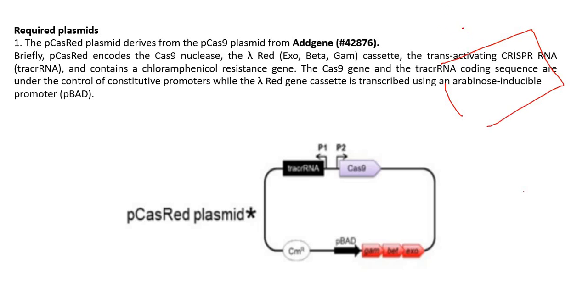In the last plate you will get a single cell, and that single cell will form the multi colonies. If it is a mammalian cell, then it will take days or even a month's time, and that time you cannot spend in organizing a workshop.